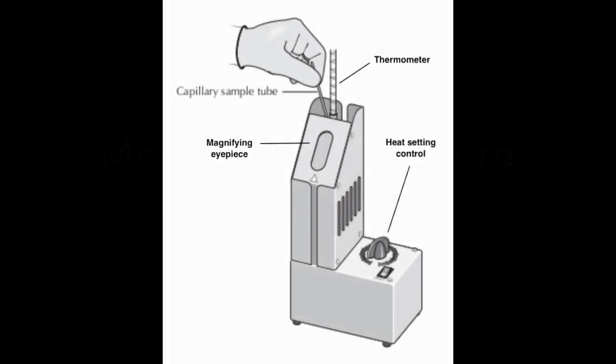Once we have our mass we can then take the melting point of the pure crystals using the meltemp apparatus. We place our eye in front of the magnifying eyepiece and watch the crystals to see when they begin to melt and when they are finished melting. This is an image of the crystals as they are just about to melt. You can see that at this stage the crystals have shrunk from their original size right as they are about to melt.